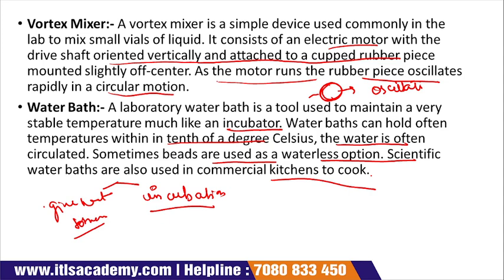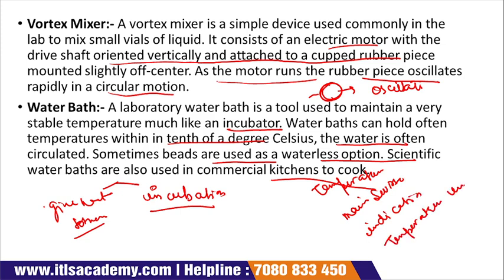Again, the water bath has a temperature knob, the main switch, the indicator, the temperature indicator, etc. Okay, these are all the functions.